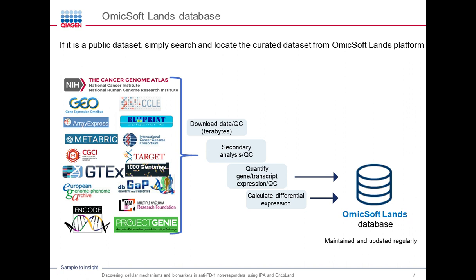You might be comparing non-responders versus responders, which is what we are going to do, or you might be comparing disease versus normal, treatment 1 versus treatment 2. This will depend on you. But basically, if you were dealing with a public data set, you'll be doing all of this. Now imagine you're doing the same thing with hundreds, if not thousands of public data sets, because you want to generate a powerful hypothesis or a powerful discovery. You would have to repeat this process for hundreds, if not thousands of data sets.